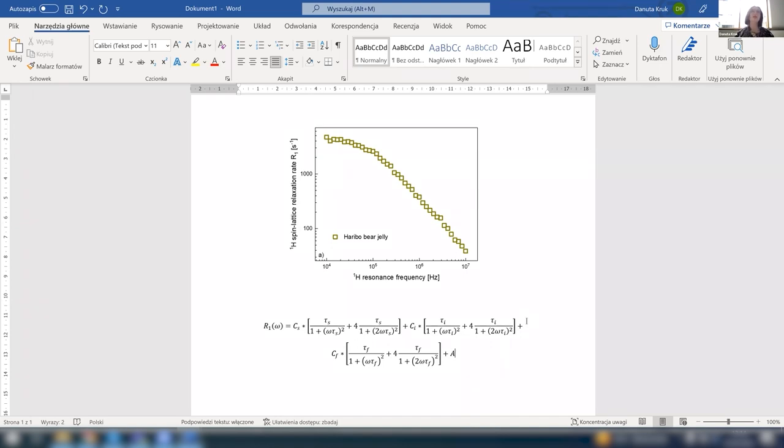Actually, people quite often, as we discussed recently, assume that dynamics is heterogeneous, so it is a kind of distribution of the correlation times. Whether this is true, here we do not make any assumptions. You could treat the decomposition as a kind of distribution, because if you say that there are 3 contributions to the relaxation, it means at least 3 kinds of dynamics, but it comes in a natural way. You do not assume that there is a distribution of correlation times following some Gaussian law or something like that. You just get the information in a natural way.